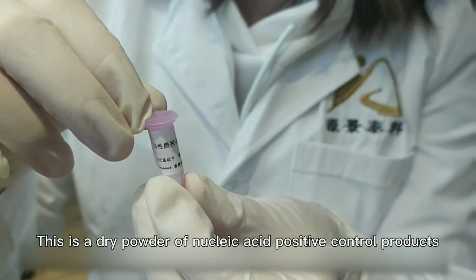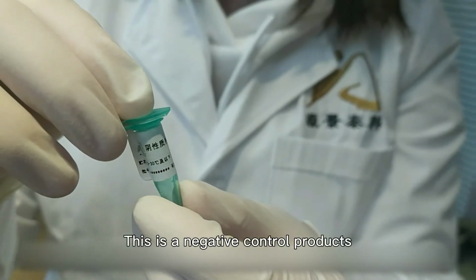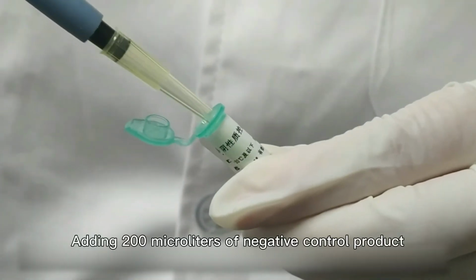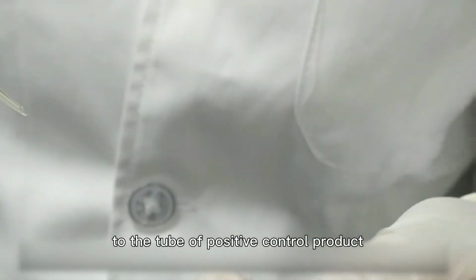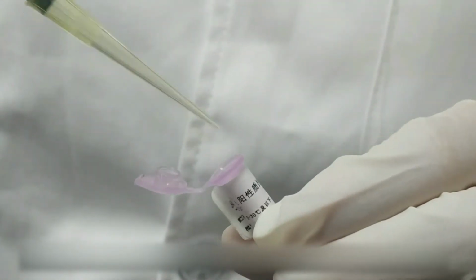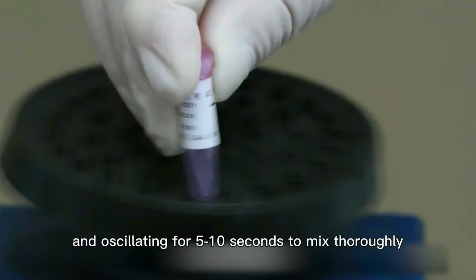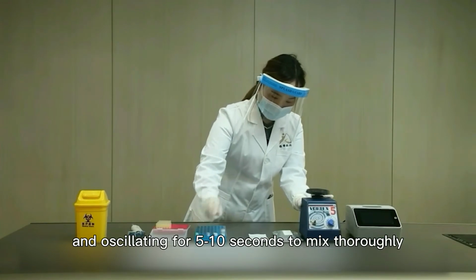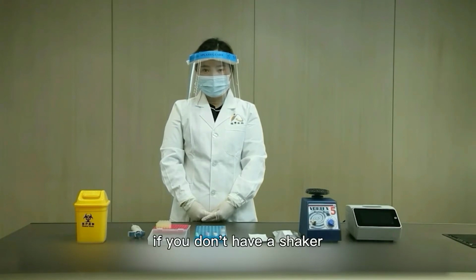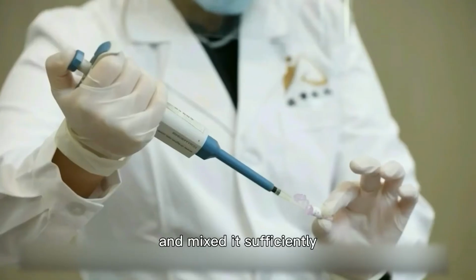This is dry powder of nucleic acid positive control product. This is a negative control product. Add 200 microliters of negative control product to the tube of positive control product. Put it on the shaker and oscillate for 5 to 10 seconds to mix thoroughly. Then insert it on the collection tube holder for standby. If you don't have a shaker, you could blow and suck twice with a pipette to mix sufficiently.